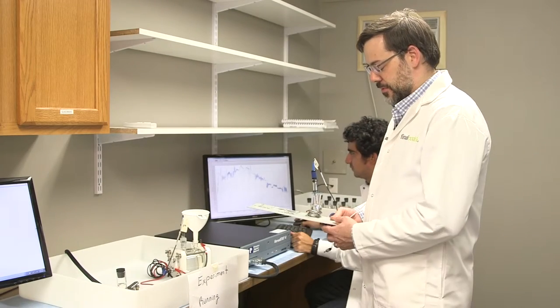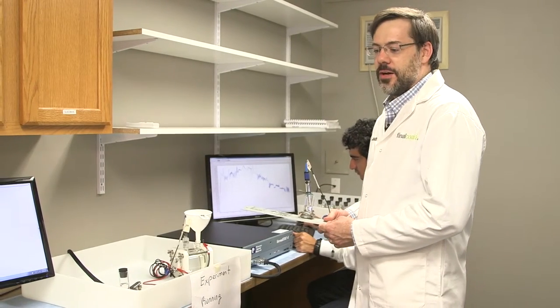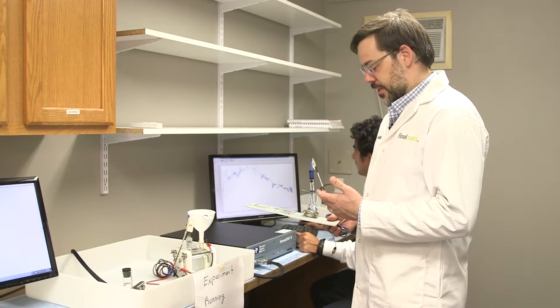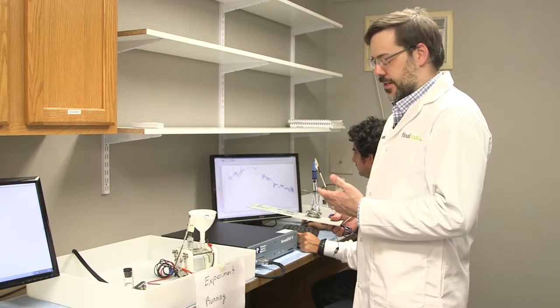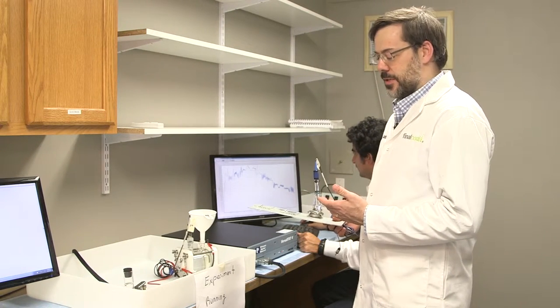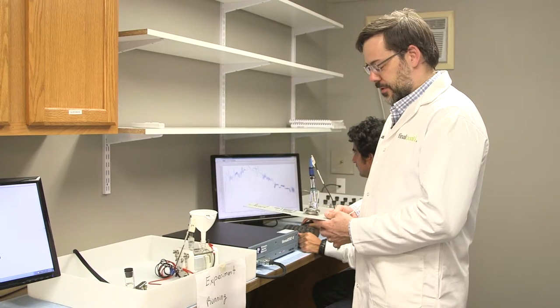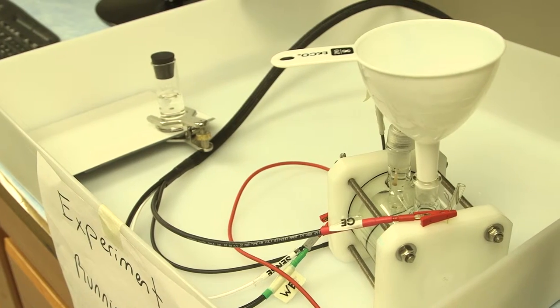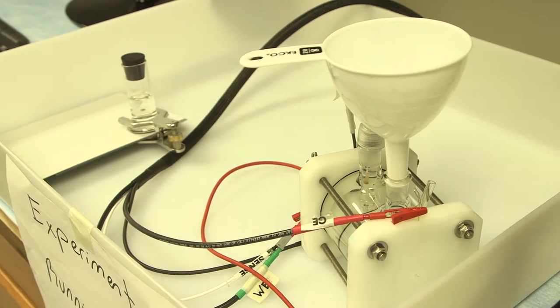Another piece of equipment that's very important to these studies is the cell, which is what we use to expose the material to the electrolyte in order to measure its electrochemical properties. Here we have two examples of cells. This one is called a flat cell and is being used in the current experiment.